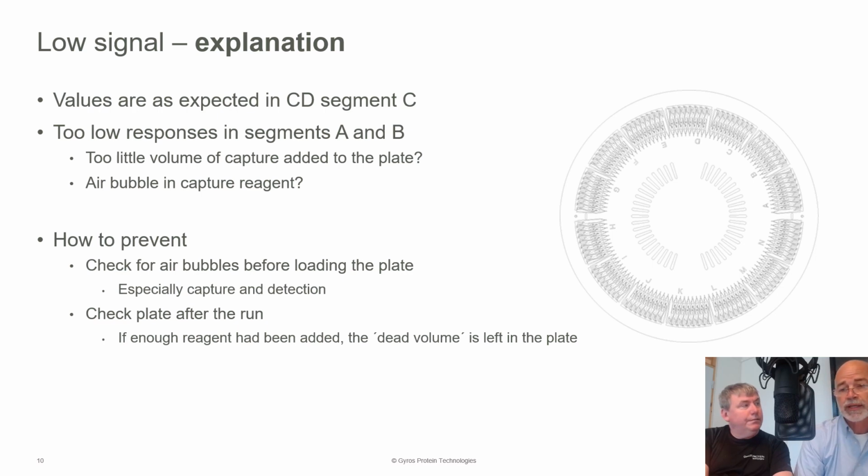Now, I've had customers that like to spin the plate to reduce the chance that there's a little air bubble at the very bottom of that microtiter plate well. Now that can have some negative consequences though. So if you have samples that could potentially be pelleted, then you're going to create a little pellet at the bottom of the well. So spinning isn't always the right answer, especially with plasma or serum samples.